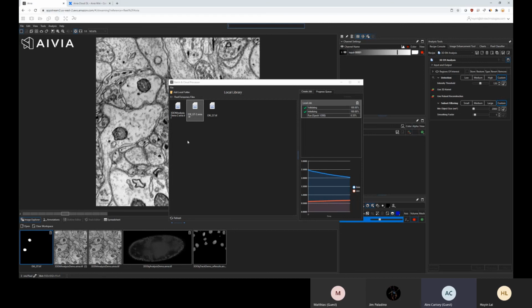We usually take 8 to 10 because the STED is rather a destructive way to image, so we can't really image a gigantic volume in the STED. I see. Yeah, so for that the 2D should work, because it only takes in the 2D information anyways. So it will just treat all 8 of those slices as individual data points.